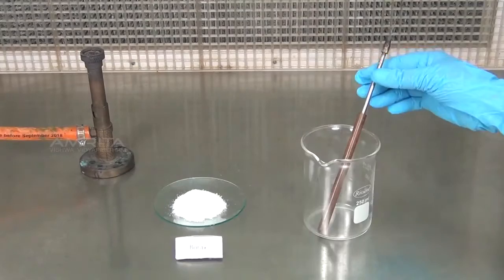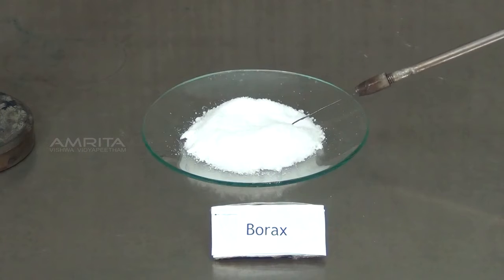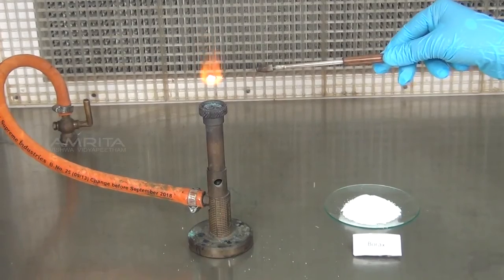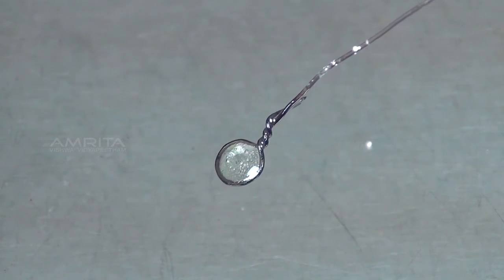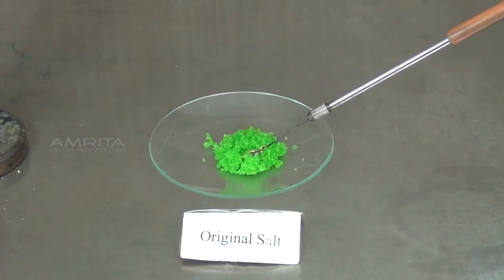Procedure: take a small quantity of borax powder in the loop of platinum wire by dipping it in borax powder. Heat it in the flame of the Bunsen burner. Borax swells and forms a transparent colorless glassy bead. Dip the hot bead in the watch glass containing salt.